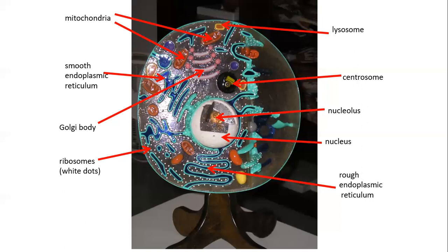The first organelle here is mitochondria. You can see these orange ovals. There are other places in addition to the labeled ones. Mitochondria function as the organelle that makes ATP. You have seen the role of ATP in lecture material a number of times. So this is the linkage to the actual location where it is being made.